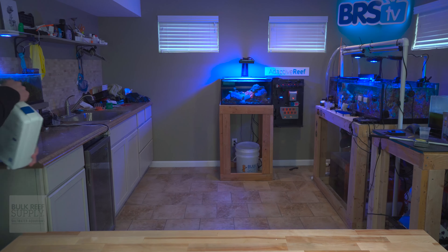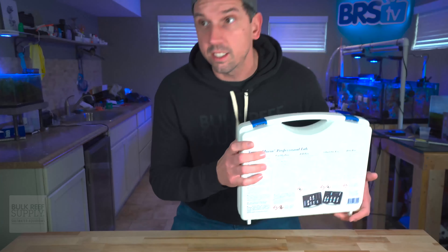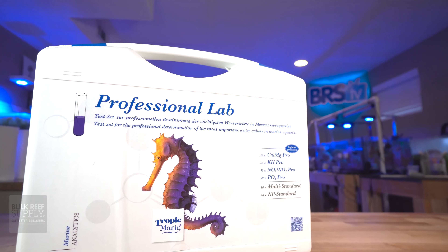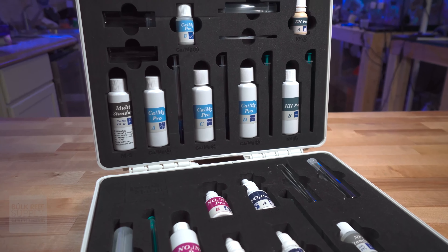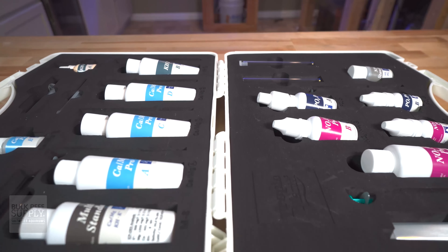Excuse me, just a man carrying a briefcase filled with reef testing supplies — no Jurassic Park embryos in here, I promise. What's up coral people, my name is Remy and today we are going to talk about a one-stop shop that is affordable for testing your aquarium parameters. The Tropic Marin Professional Lab Test Kit literally has every single test you're going to need to make sure that your parameters are in check, all in this handy-dandy case right here.